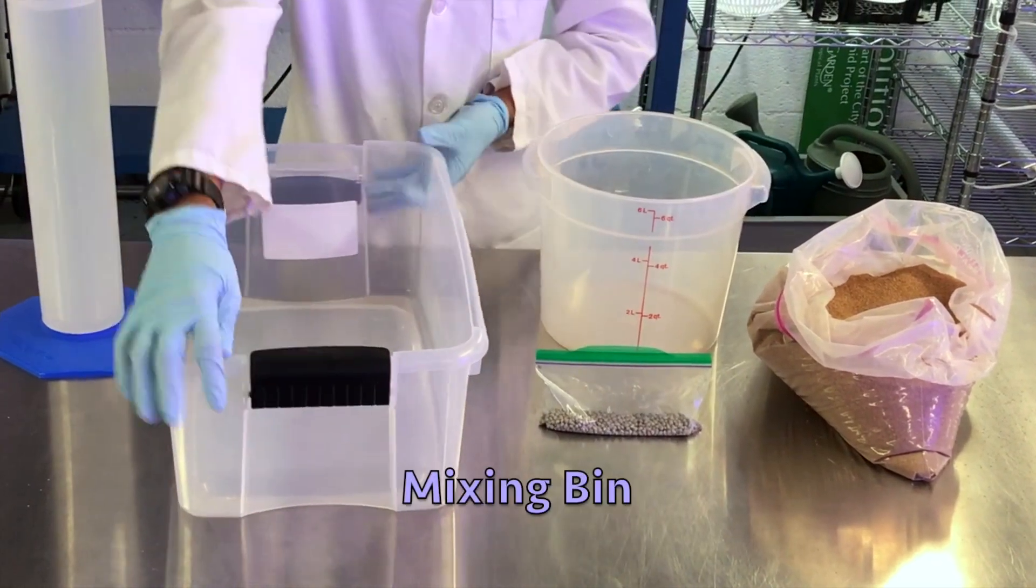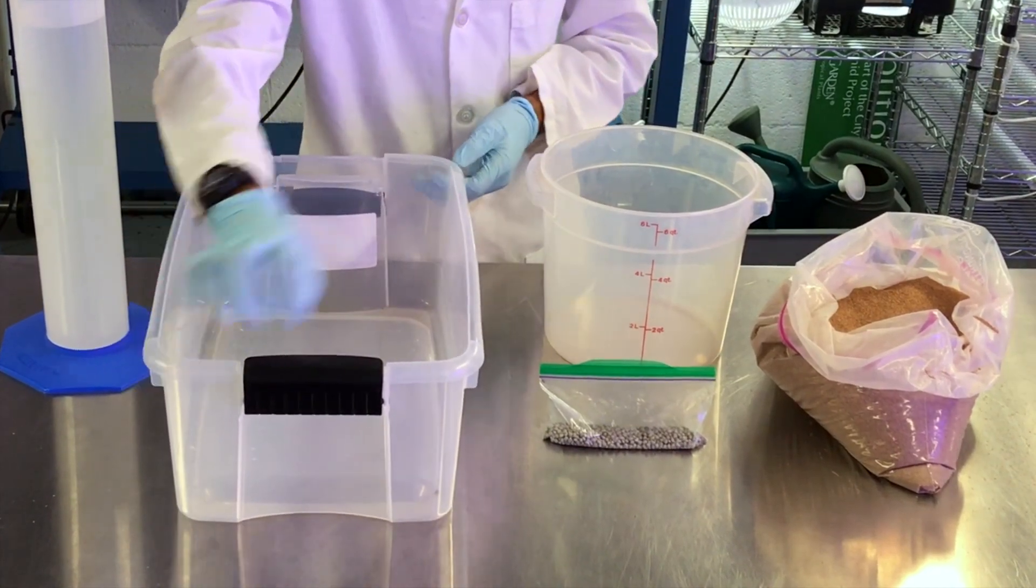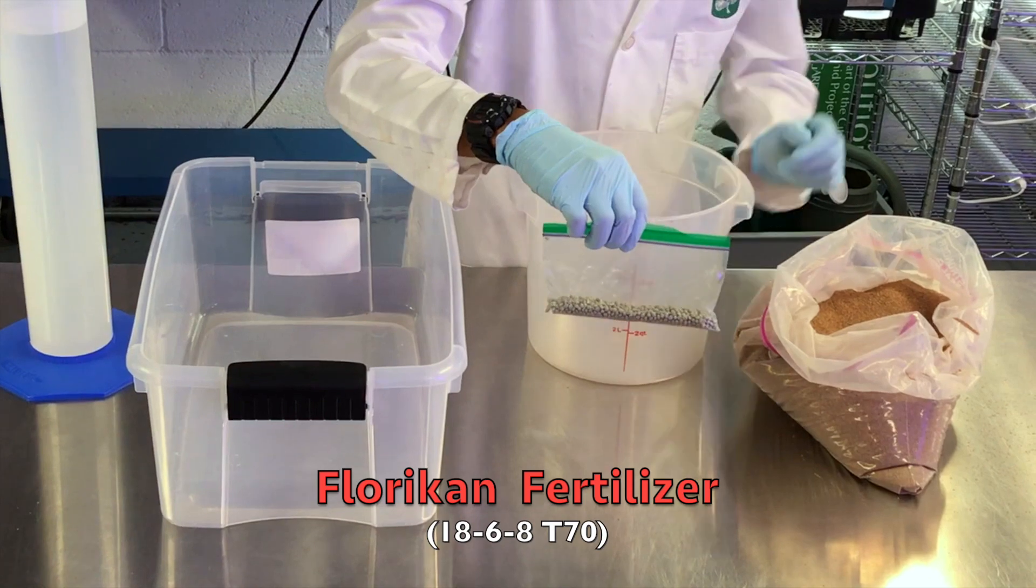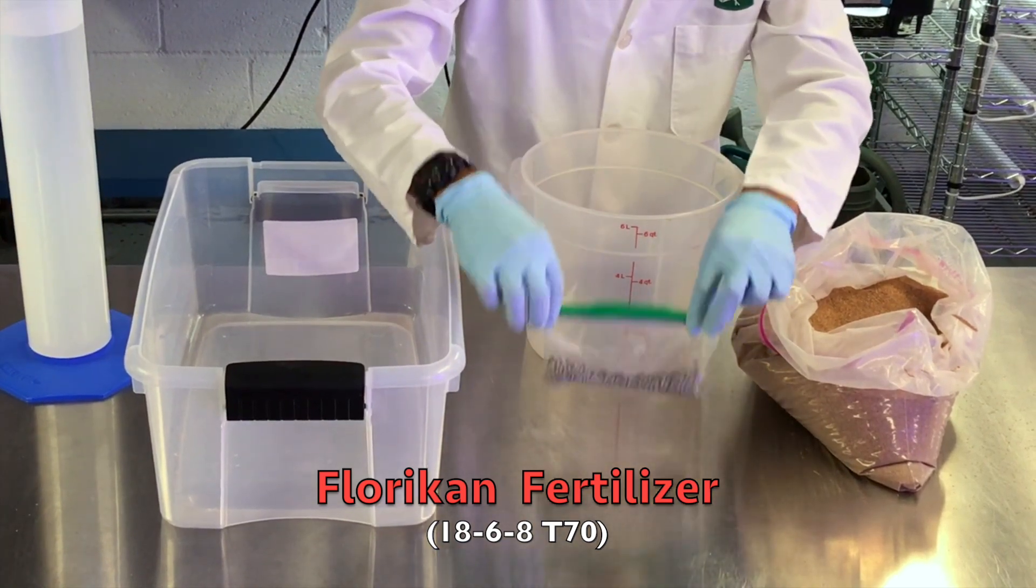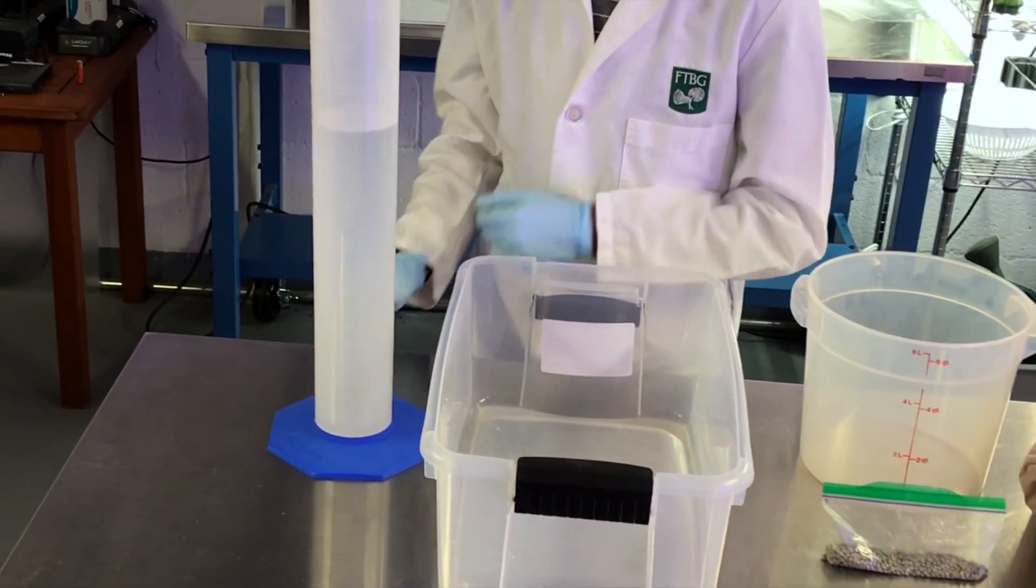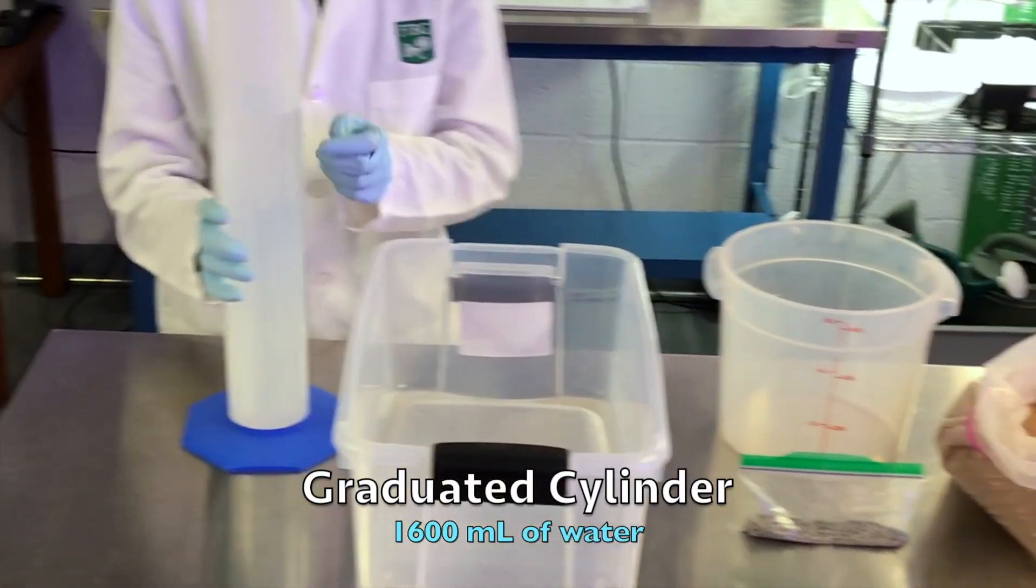A mixing bin in which you will mix all the contents of the medium, Florikan fertilizer which is a polymer-coated slow-release fertilizer with the nutrient ratio 18-6-8 and a release time of 70 days, and a graduated cylinder.